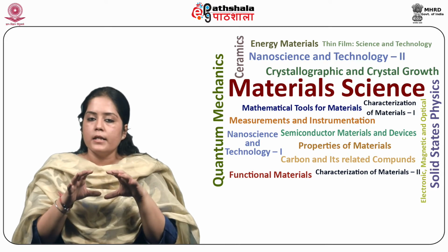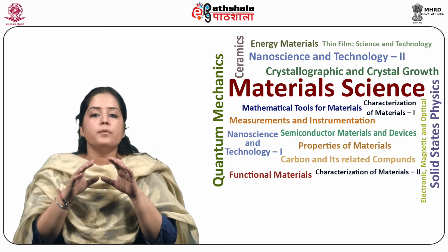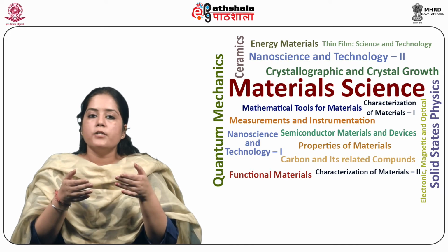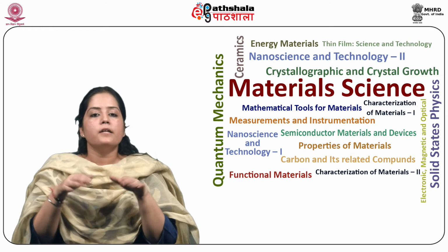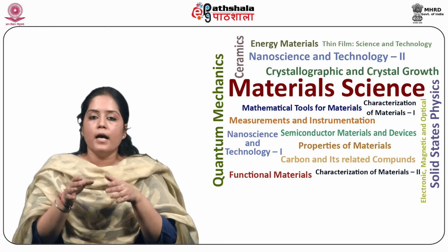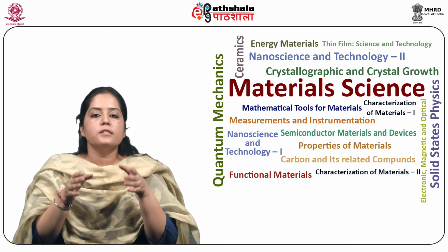So the iodine reacts with the gaseous tungsten formed by sublimation and produces a volatile compound WI2. So as WI2 molecules hit the filament, they decompose and redeposit the tungsten back on the filament. The tungsten halogen lamps usually have a lifetime twice that of the conventional tungsten filament lamp.